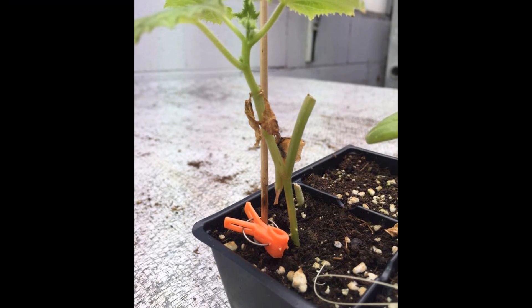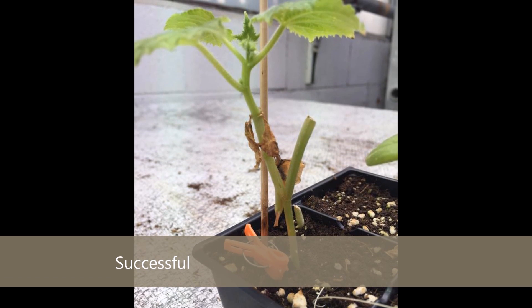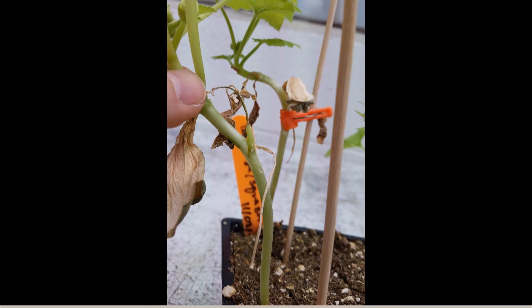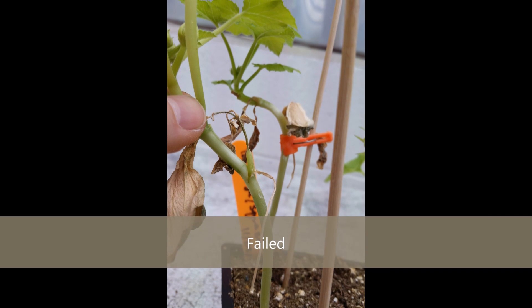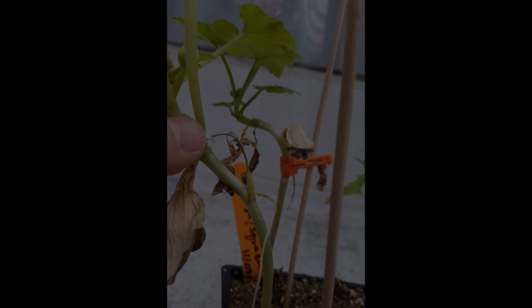The tongue approach grafting technique worked very well, but only on two grafts. We can see here that the scion grew well, which means that the vascular cambium healed properly. In some cases, the graft failed because the scion aborted completely. The success rate was then below our expectation, which is why we decided to graft again some extra plants with another technique.